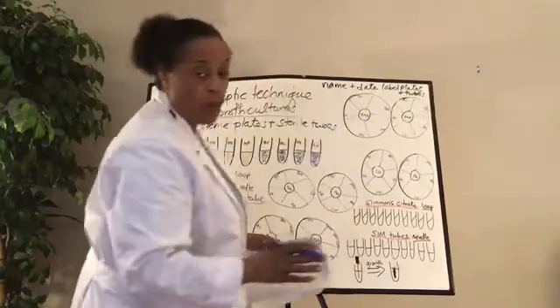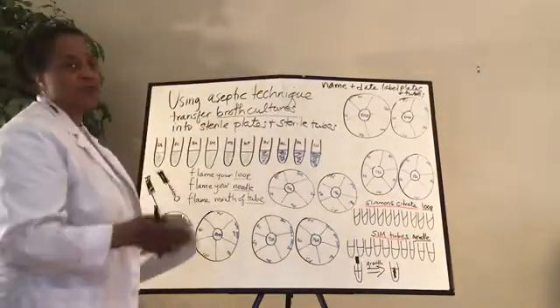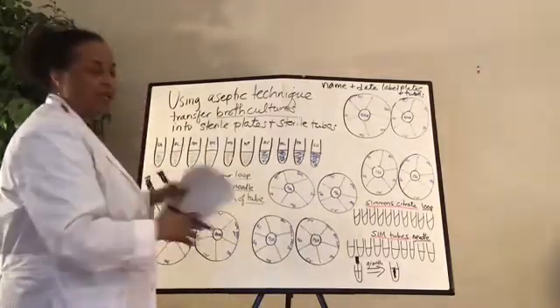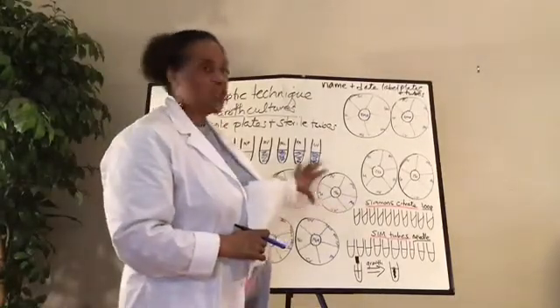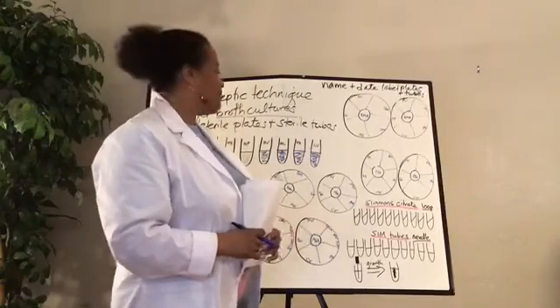I don't want it all on one page like this. This is too messy. Please use different pages and spread it out. Don't cramp it up like this. But this is just so I can get the video in and get the gist of it. But the point is, I want the bacteria labeled in each well exactly the same as this on each of the agars, okay?